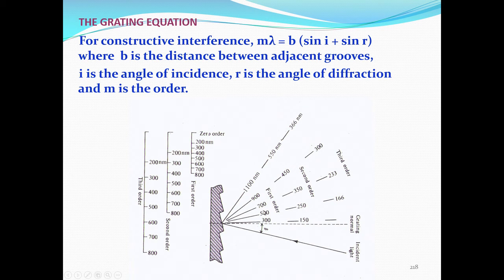So, in any grating, these are the basic problems with gratings. We have to minimize the second order and third order radiation, because that is the wavelength that also comes out automatically along with any chosen wavelength. For example, if you choose 1100, it is always associated with 550 nanometers, and half of that is again 366 nanometers, and similarly 900 will have 450 and 300, and it need not be exactly half, but it will be approximately. So, this is the problem with gratings.